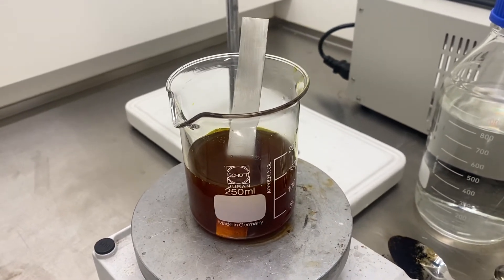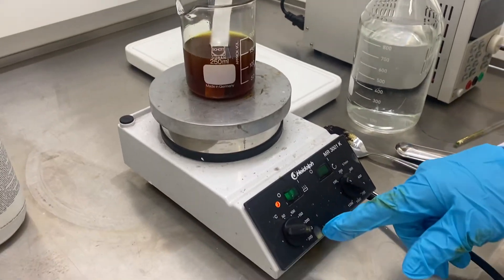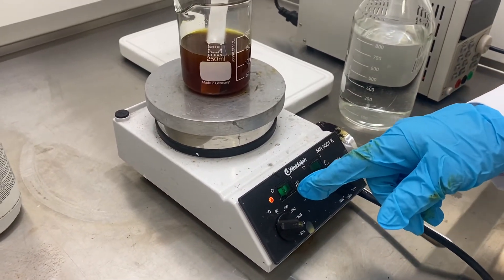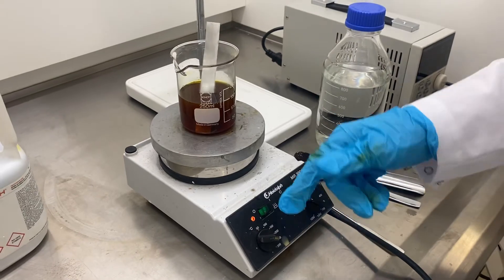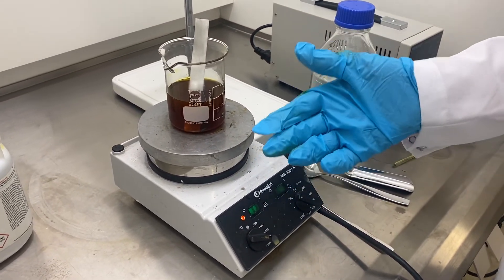I'm going to take out the spatula. We're going to heat that up to almost boiling point and leave it for several hours. Then we'll come back in a second video to look at the effect of the ferric chloride and the formation of pits.